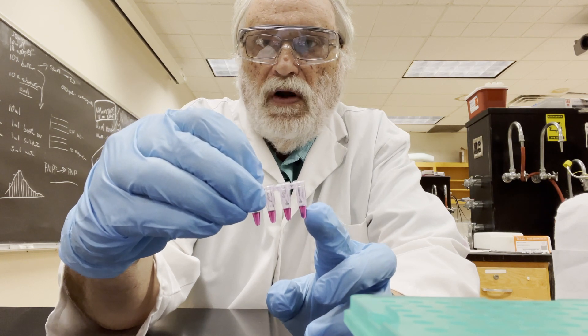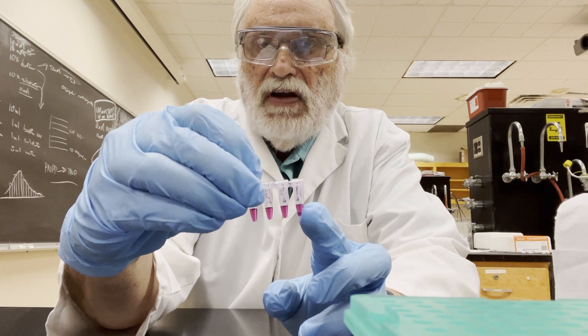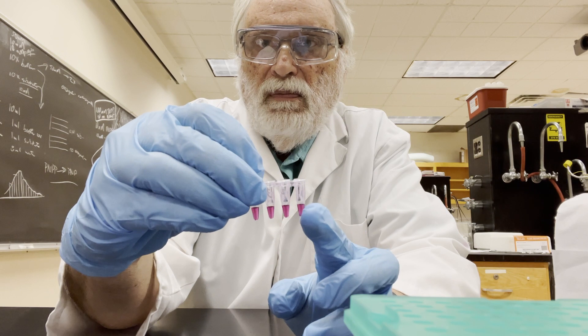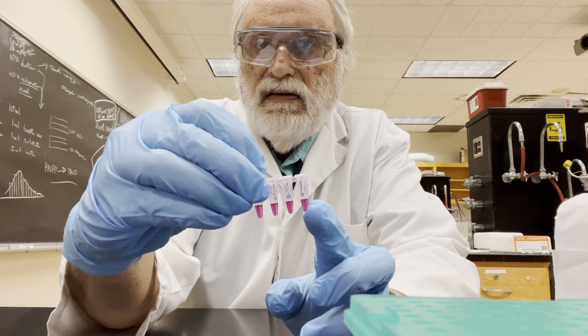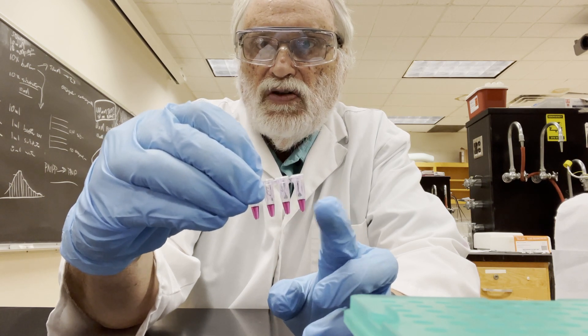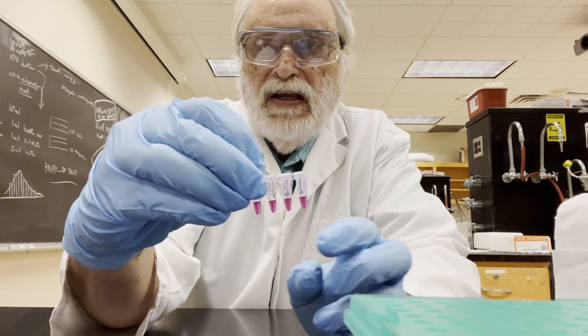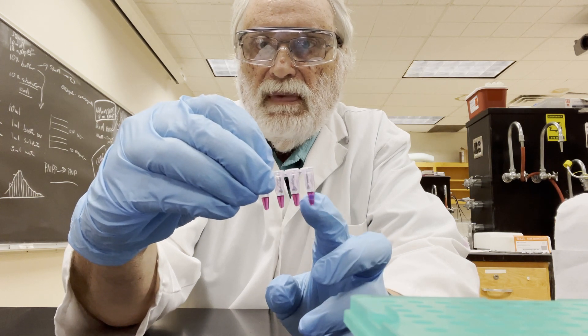And what it is, is these solutions contain 25 microliters of 2X Apex Red solution. They contain 1 microliter of O27 oligonucleotide, 1 microliter of O28 oligonucleotide, and then 23 microliters of water. So these reactions are about 50 microliters each.